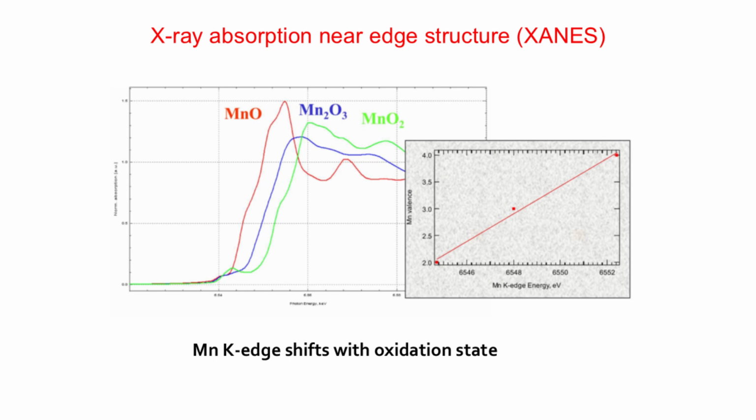And the more reduced the material, the more reduced the atom or ion that is the absorber, the more the absorption edge energy will shift to lower energy. The reason is that reduction means it has on average more electron density, and that electron density more efficiently screens the nucleus potential that attracts the electron to the atom and keeps the electron in the atom. The more screening, the less potential there is to overcome. It's like Moseley's law. Because it's a less effective potential, the excitation occurs at lower energy. So that's why you can say roughly by looking at the edge position which oxidation state is higher or lower. You can even calibrate it, though it's not a hard rule, because for some materials it just doesn't work as supposed.